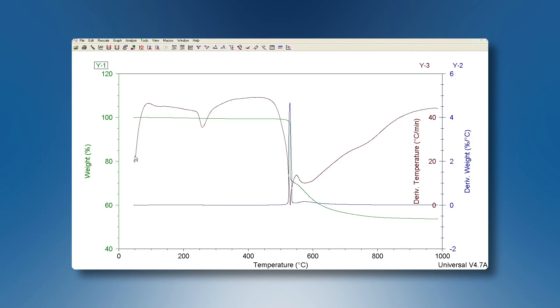This is the experiment of the same material but in the high-resolution TGA. As you can see, the heating rate is no longer constant — it will decrease when we have the transitions. That's the way we improve the resolution.